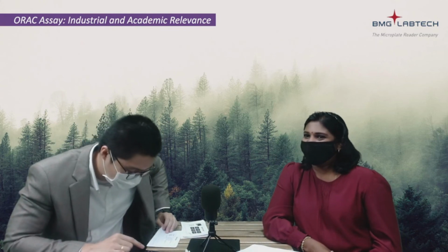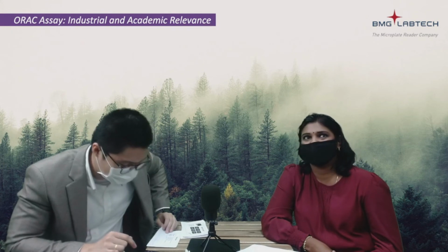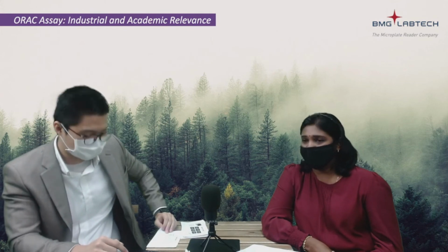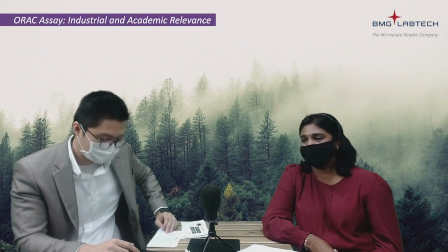Compared to the DPPH test, I believe, is ORAC more sensitive or easy? Yes, ORAC is a more sensitive assay compared to DPPH. In terms of handling, the DPPH assay is more simple compared to ORAC, because in terms of time and preparation, ORAC definitely will take more time. But in terms of sensitivity and accuracy, I would recommend ORAC.